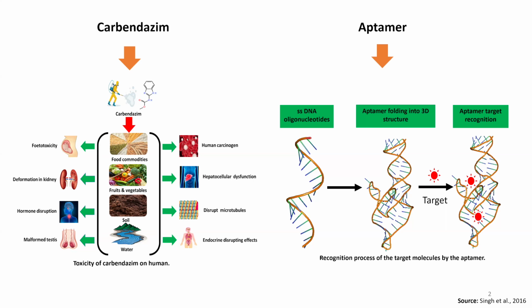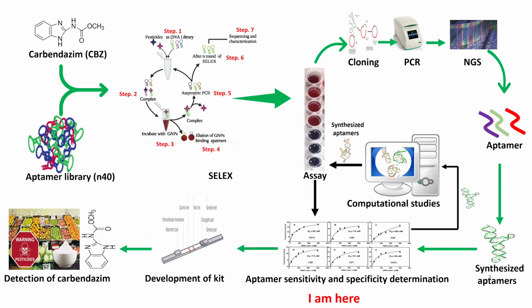As you all know, an aptamer is a single-stranded molecule, and when it binds to the target, it folds into a tertiary structure and makes a complex. So now the SELEX comes into the picture. I have performed the SELEX, and in the SELEX I have used gold nanoparticles. Let me explain why I used the gold nanoparticle. This is the overall pictorial representation of my SELEX technology.